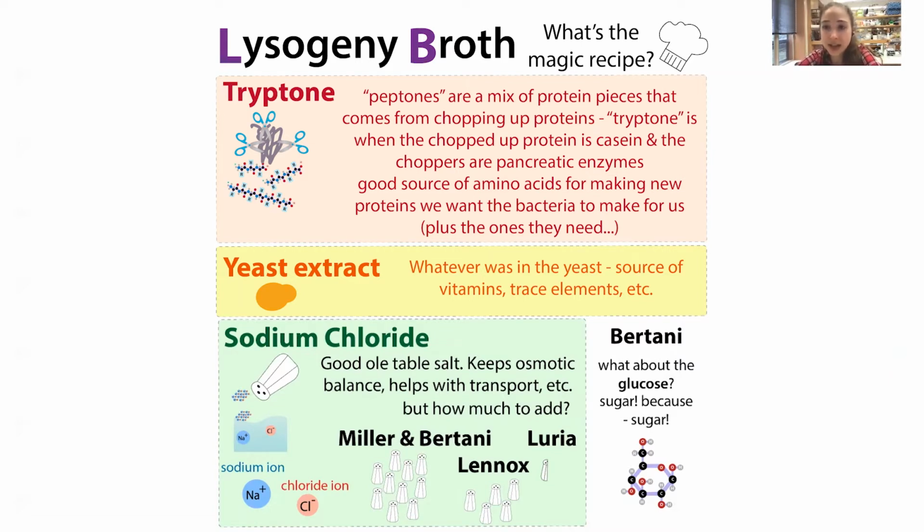He called it lysogeny because he was studying lysogeny, which is a phase in some viruses' life cycle when they infect bacteria, and they just hang low for a while and replicate. And then later the bacteria go into a lytic phase where the virus actually breaks open the bacteria. But when he was working in this lysogeny phase, so he was studying this, it's lysogeny broth. This is what he was growing it in.